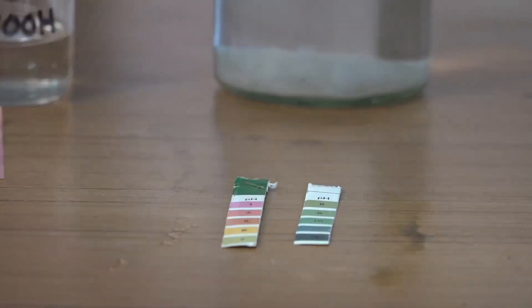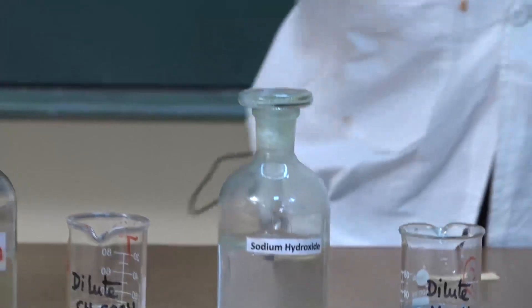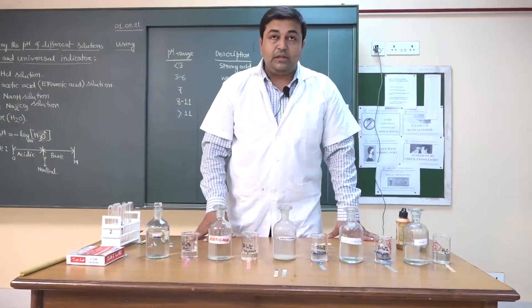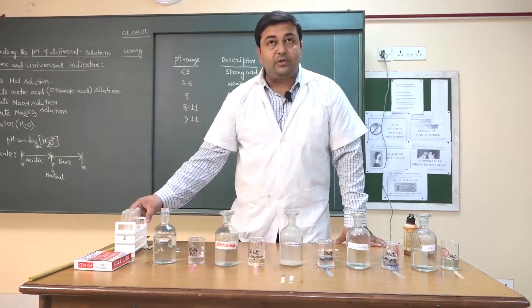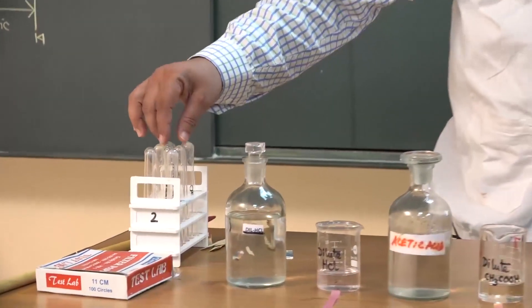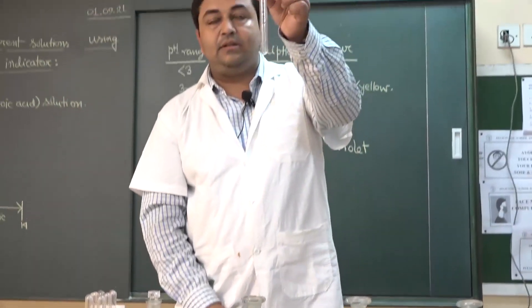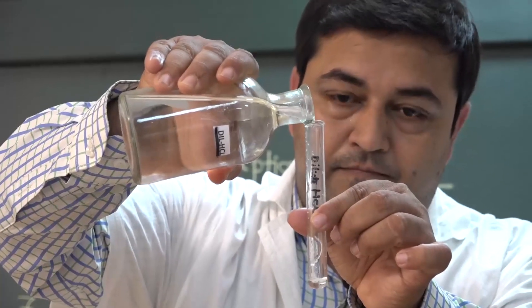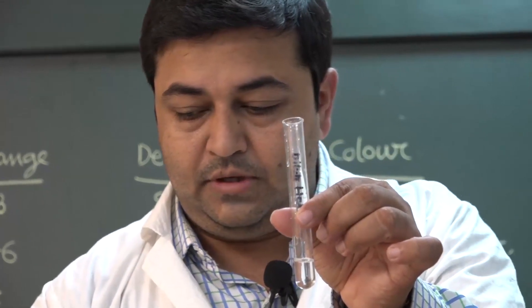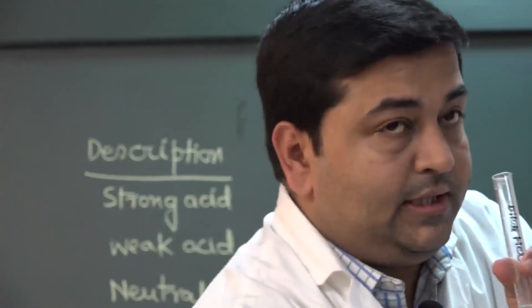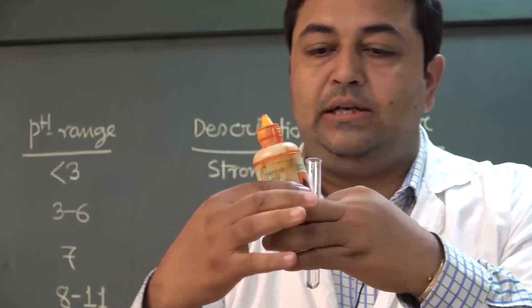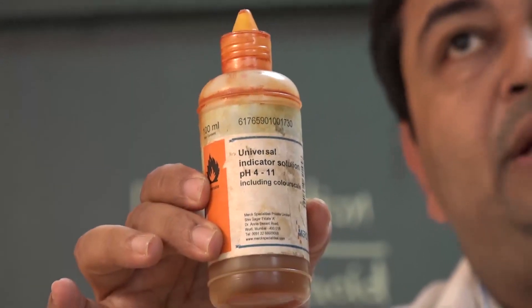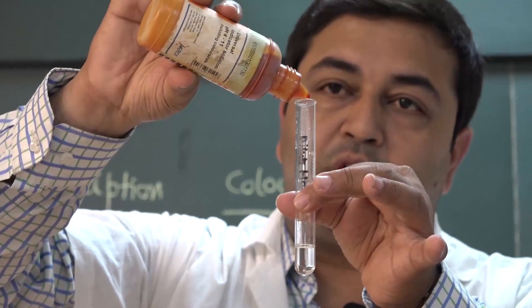From the pH paper we can identify the pH of different solutions. Similarly, we can identify the pH using a universal indicator. In the test tube we will take each solution one by one — starting with HCl. This is the universal indicator bottle, and adding one or two drops we check the color change.